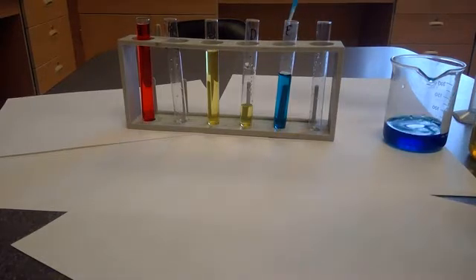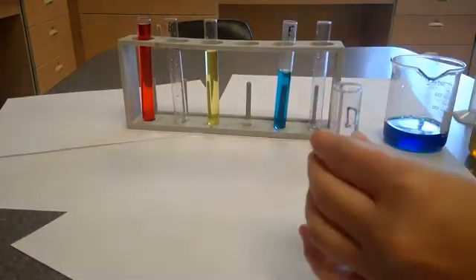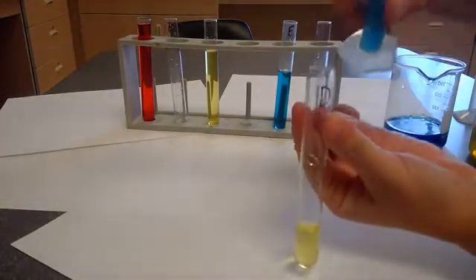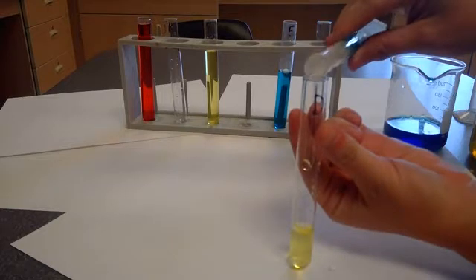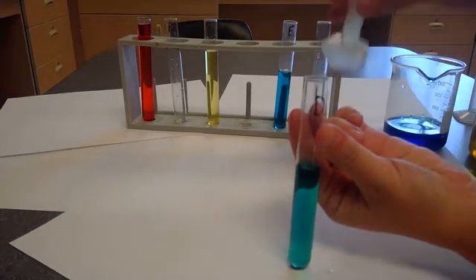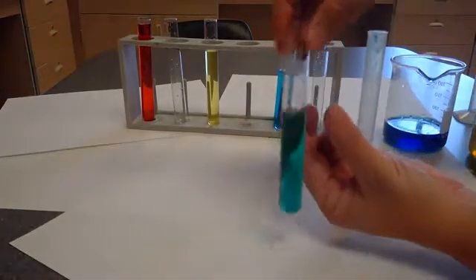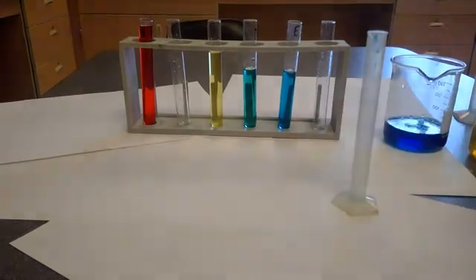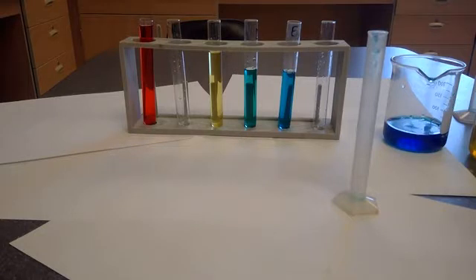And the extra goes back into here. And then I'm going to place this and I'm going to mix it into here. See if I can do this in a way where my hand is not blocking that view. So there you go. All right, so it looks like so far I've got red on the far end. I've got yellow, green, blue.